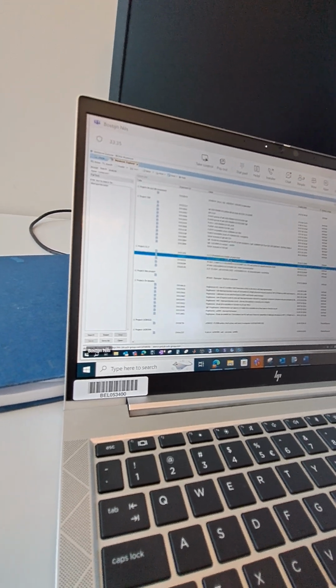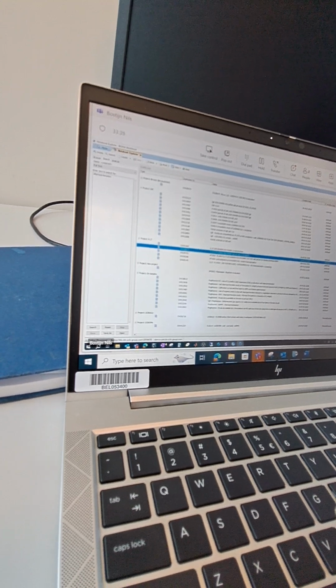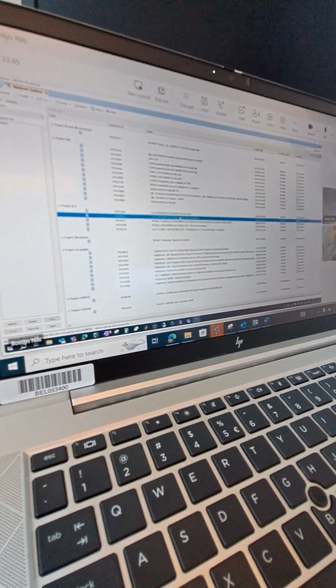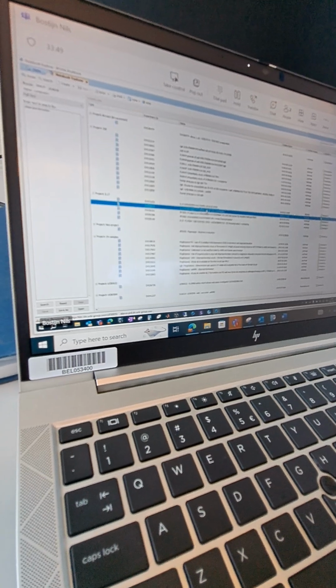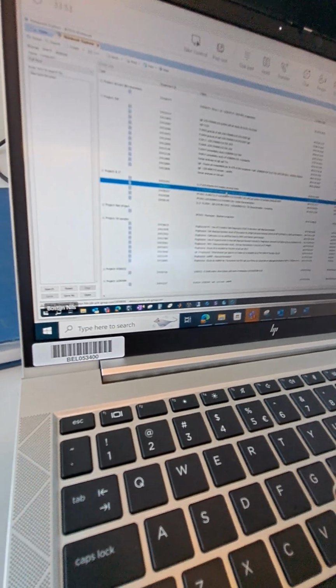Those are specifically related to the salt that you will work on. For this we documented everything very well in the reports. The reports that I shared with you, in fact, everything is compiled.